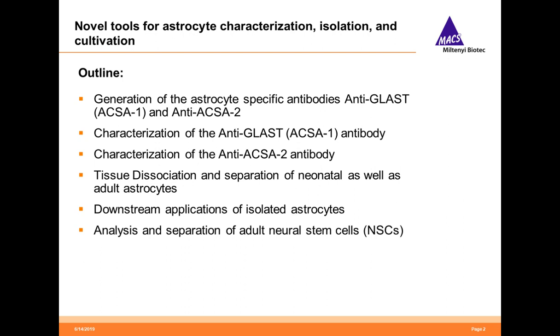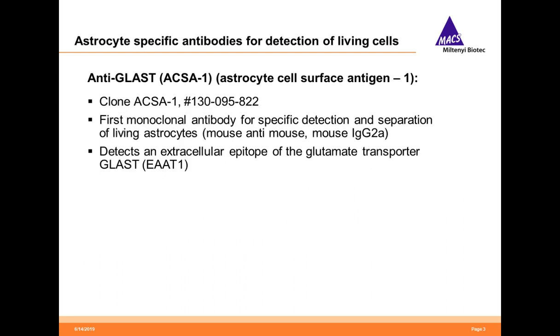In addition, we will introduce you to the analysis and separation of adult neural stem cells, which is a rare type of cells that shows astrocyte characteristics.